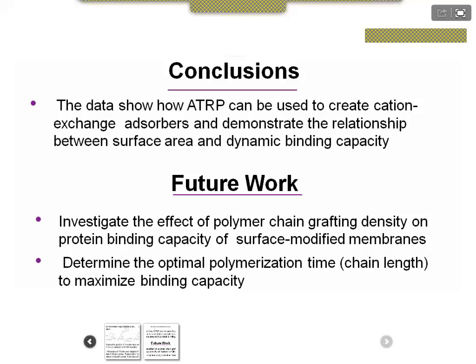Is there an alternate way to calculate the dynamic capacity that is not based on an approximate equation? Yes. The approximations are for the area under the curve, and there is an integral method, but we are still in the process of computing those.